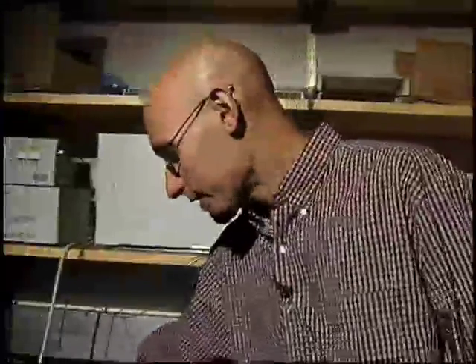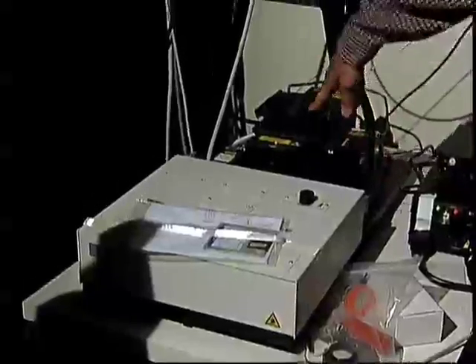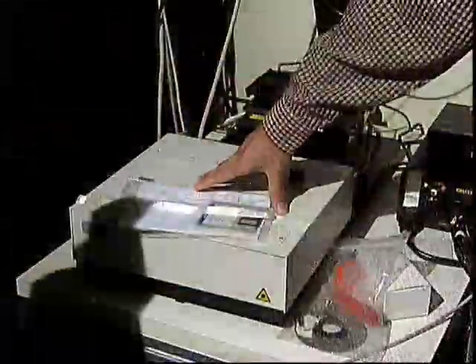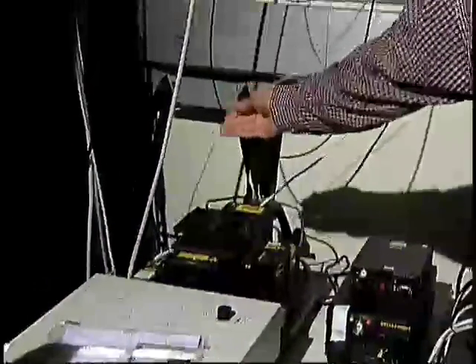We've got here the laser launch, which houses the lasers that supply light to the confocal system. On this particular scope, we have three lasers. There's a UV laser here for exciting UV-excited dyes like DAPI. A blue laser for exciting green dyes. This is a 488 laser. And then a 561 laser, a yellow laser for exciting red dyes. This box here combines those three lasers together and then launches them into this optical fiber, which sends the light to the confocal scan head.